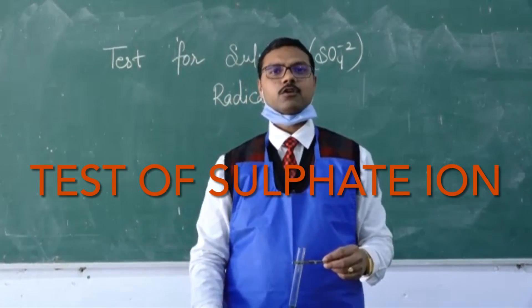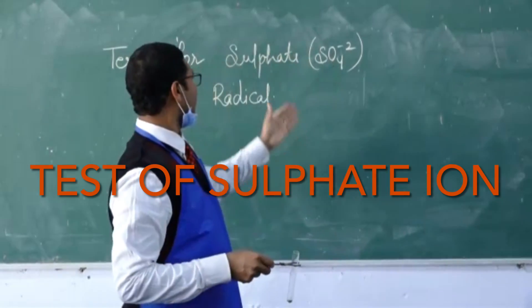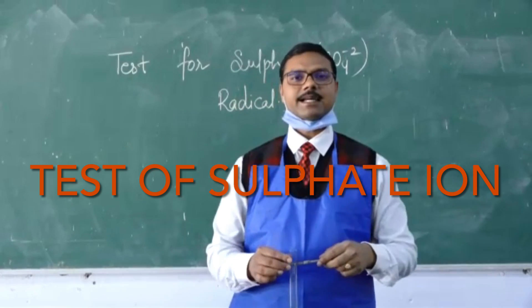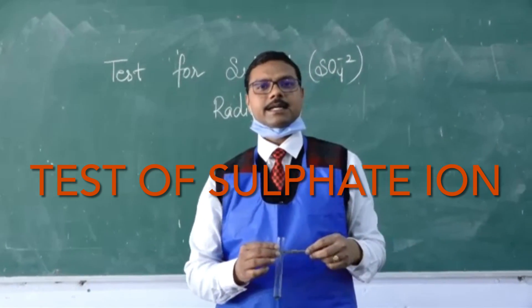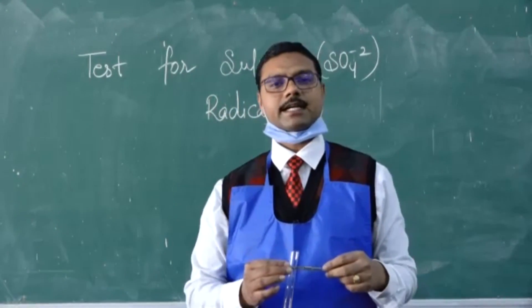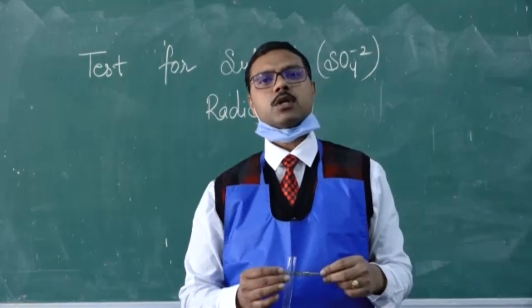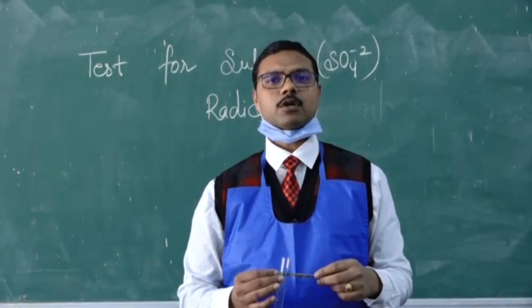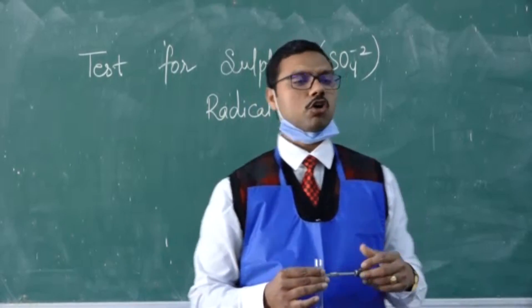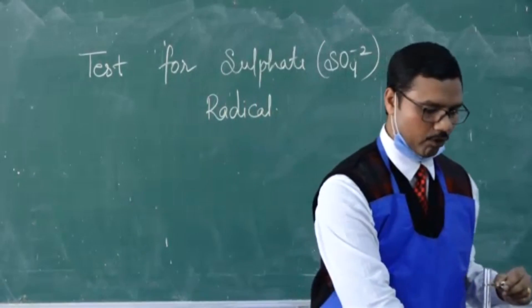Today we are going to perform how to identify sulfate radicals. Sulfate radical is a separating radical, so for identification of sulfate radicals you can use soda extract or you can use directly salt. This time we are going to use directly salt for the identification of sulfate radical. Just see how we perform it.